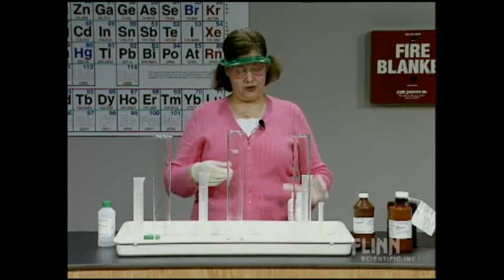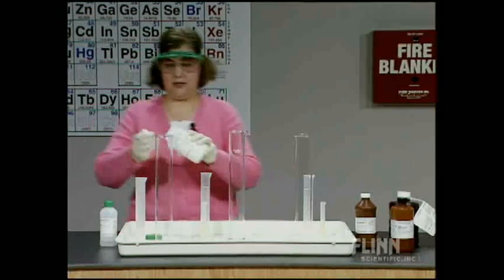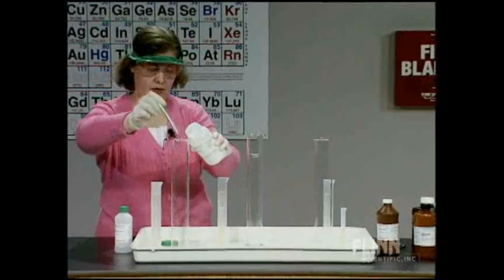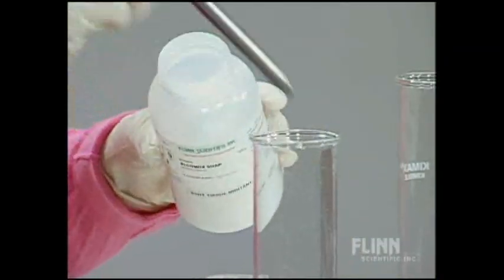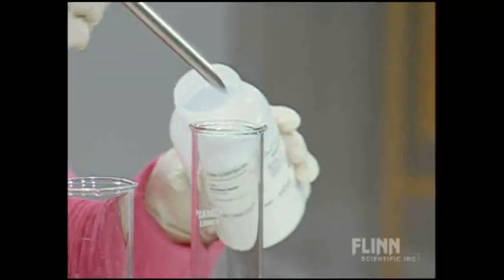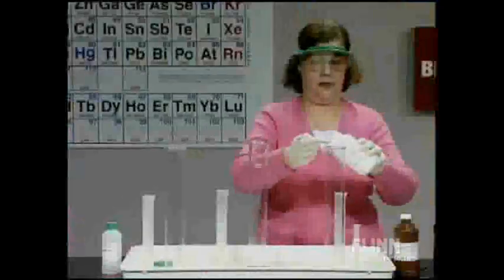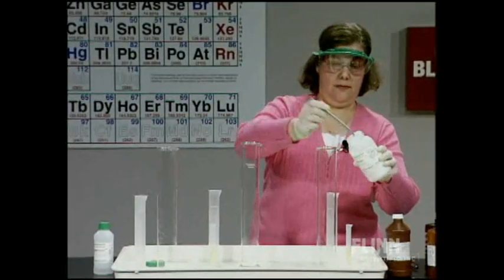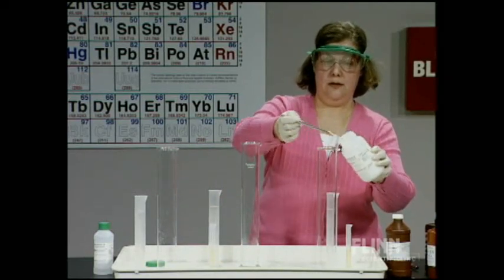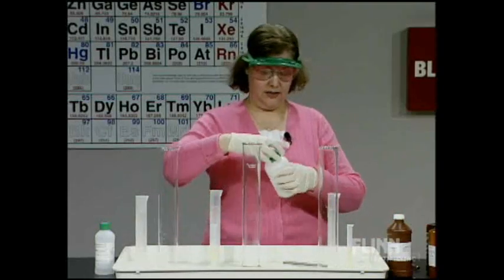In order to make this reaction a little bit more dramatic, I'm going to add some soap — this is just some common Alkinox soap — and I'm going to add a couple of spatula-fulls to the bottom of each cylinder. I'll try to add roughly equal amounts. We've got a little bit of Alkinox in each of those.